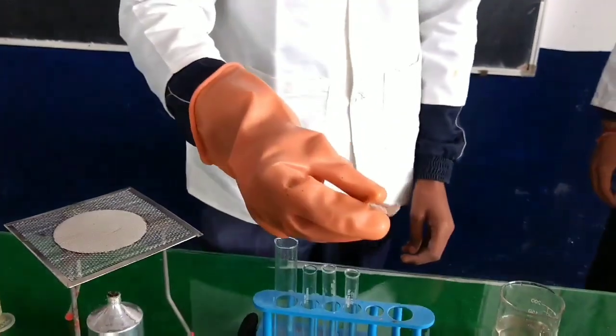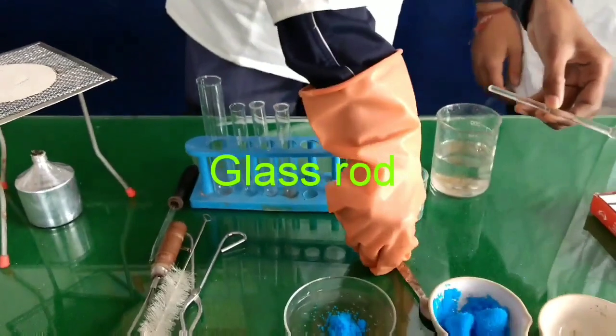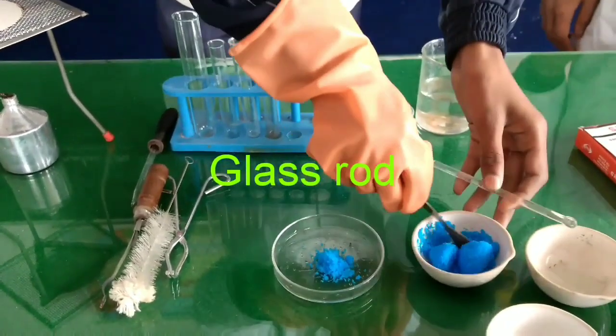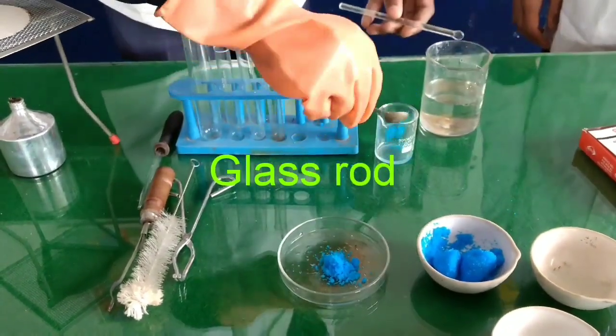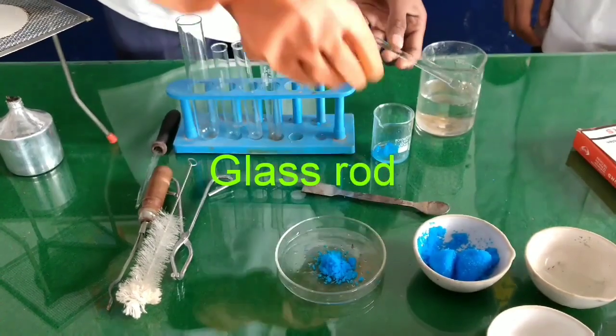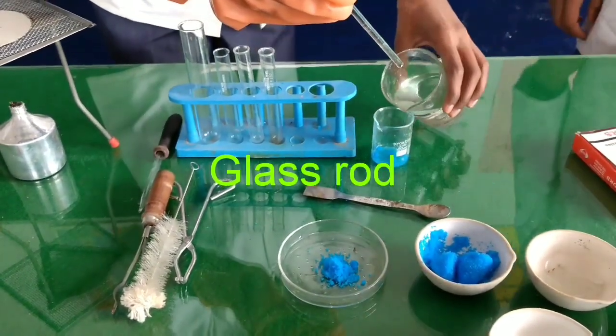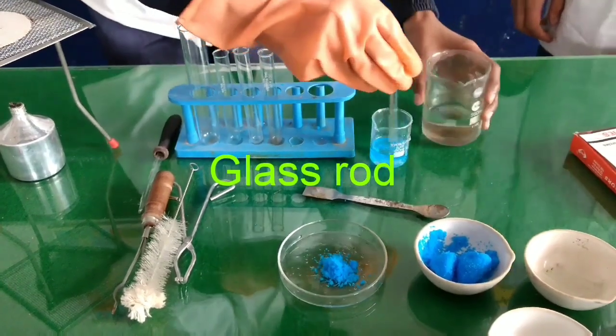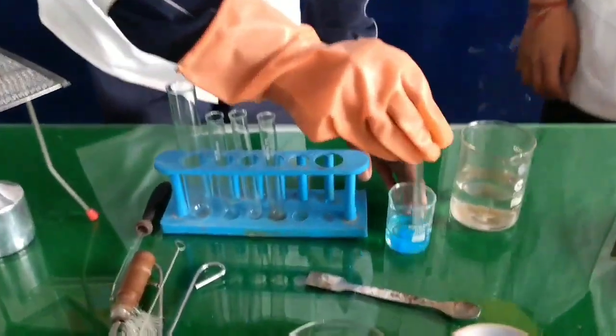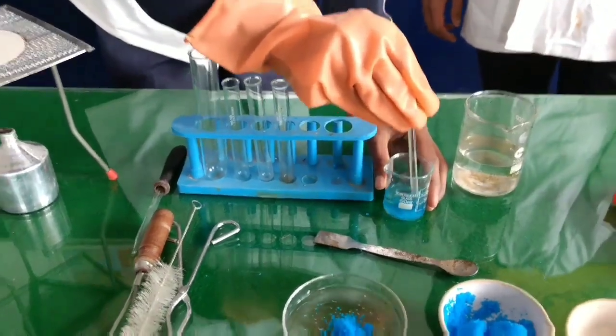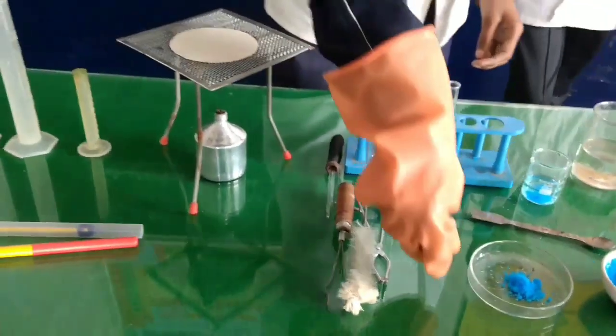And this is a glass rod. Glass rod we can use for mixing any solid in the liquid or making any homogeneous solution of liquid in liquid or solid in liquid. This is helpful in mixing the substance. You can also say it stirrer.